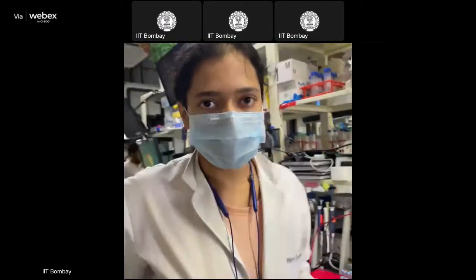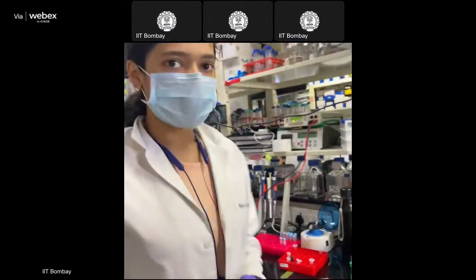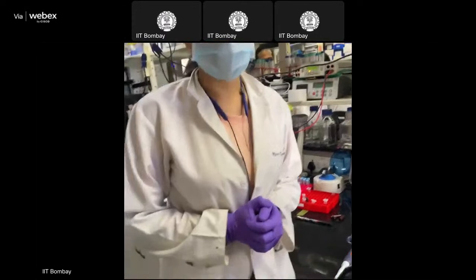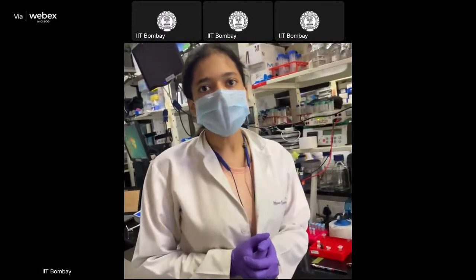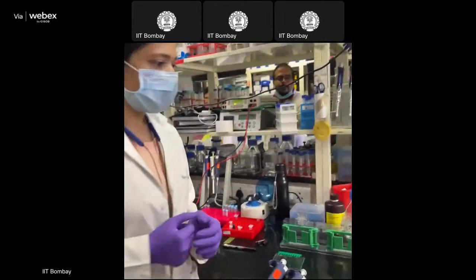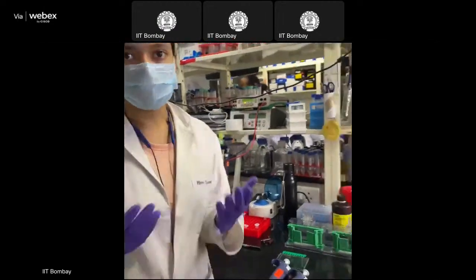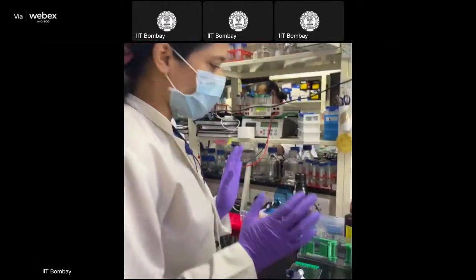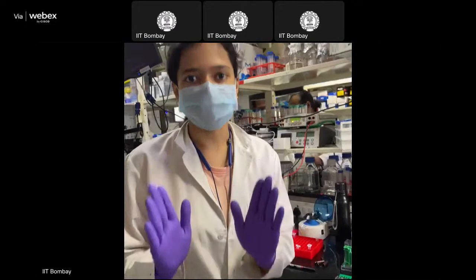Hello, Medha here. Now that we have done the quantification of the lysate, the protein sample that we have prepared, and as Ankit has explained, we did it using the Bradford assay, that is ready. Now we need to do one more step before we proceed to the digestion of the samples. First we have to run it on a gel and see how it is coming.